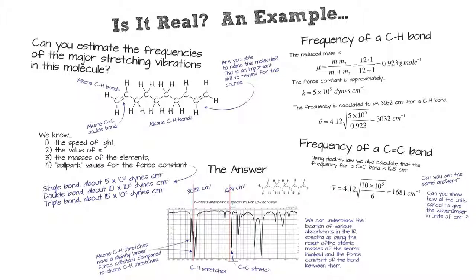So we're able to understand why we see carbon-carbon double bond peaks around 1660, 1680, 1690, and we see carbon-hydrogen peaks here around 3000. This one here is probably 1650. That's pretty typical for a regular boring carbon-carbon double bond.